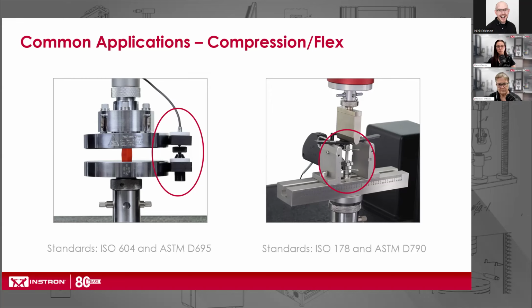Like we mentioned before with the tensile test, there are a few differences between the ISO and ASTM standards, so please be sure to read these standards thoroughly before conducting any of your tests.